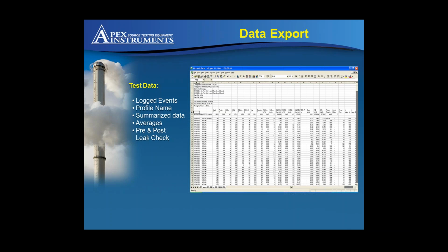But as you can see, this is your TCs here starting, and then we have our corrected volume. And then we have our mass flow target, and the very top line, right underneath each acronym for each one of the channels, that's the average for the run. And then, of course, you got corrected volume on the right, and it's just out of view.